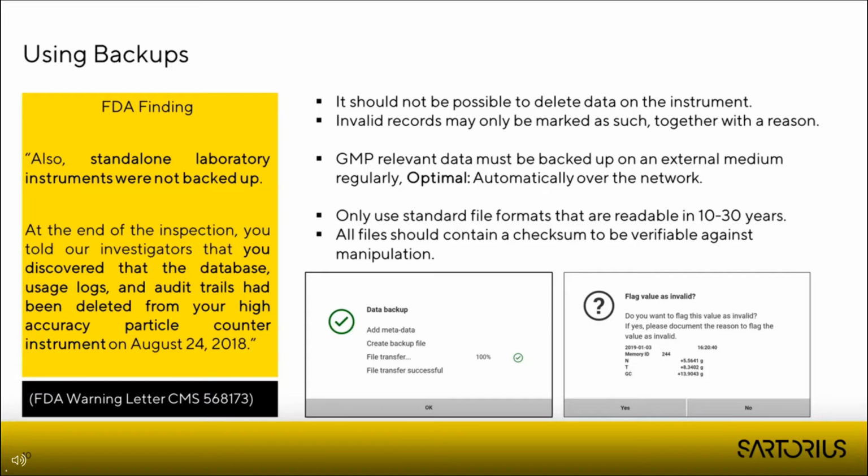They are also GXP relevant and have to be stored over the entire data lifecycle. But when you only store the data on the instrument, you can have the problem that the instrument breaks, and then you also lose your data, and therefore you should also have the possibility to back up this instrument data in a secure place.